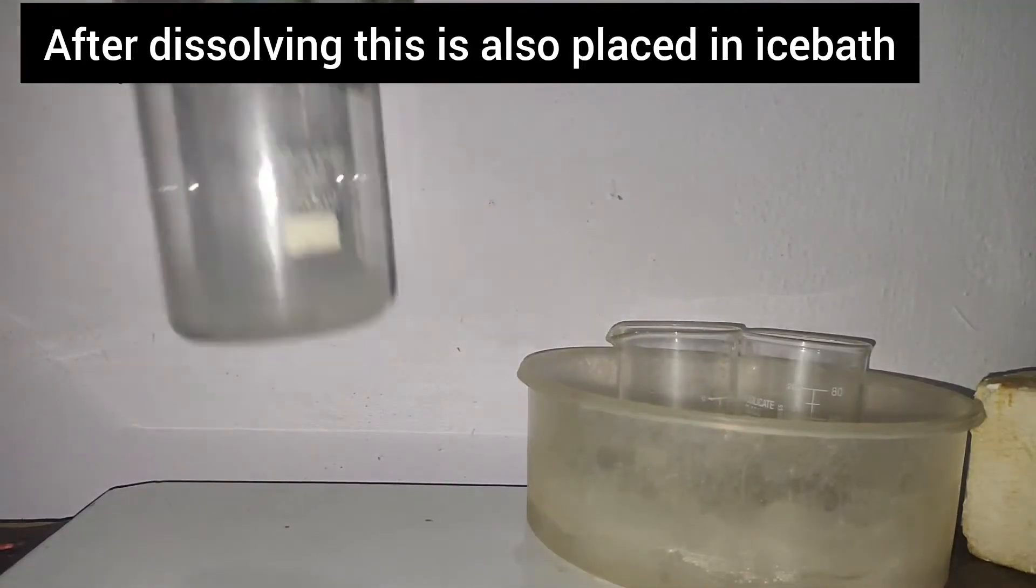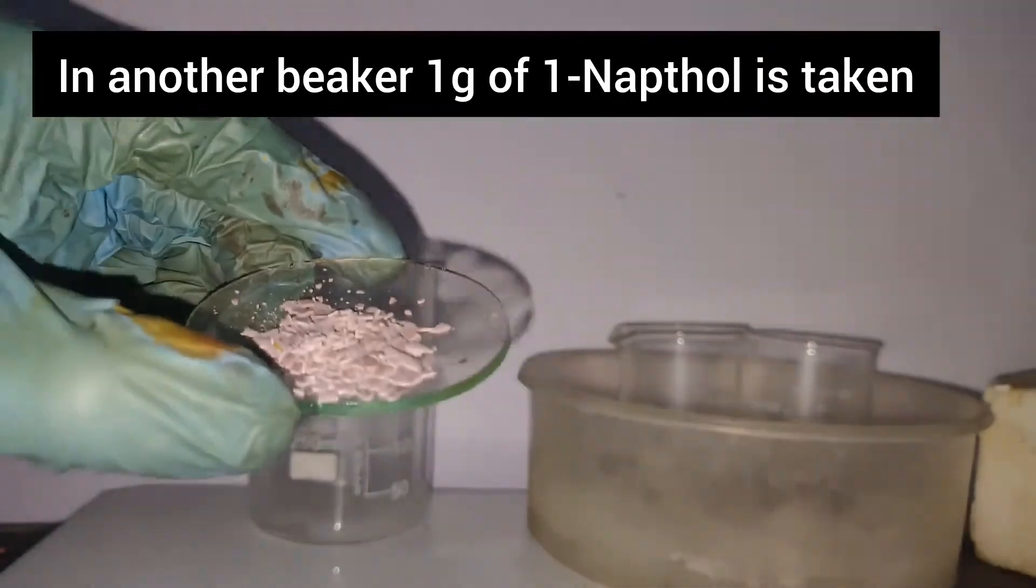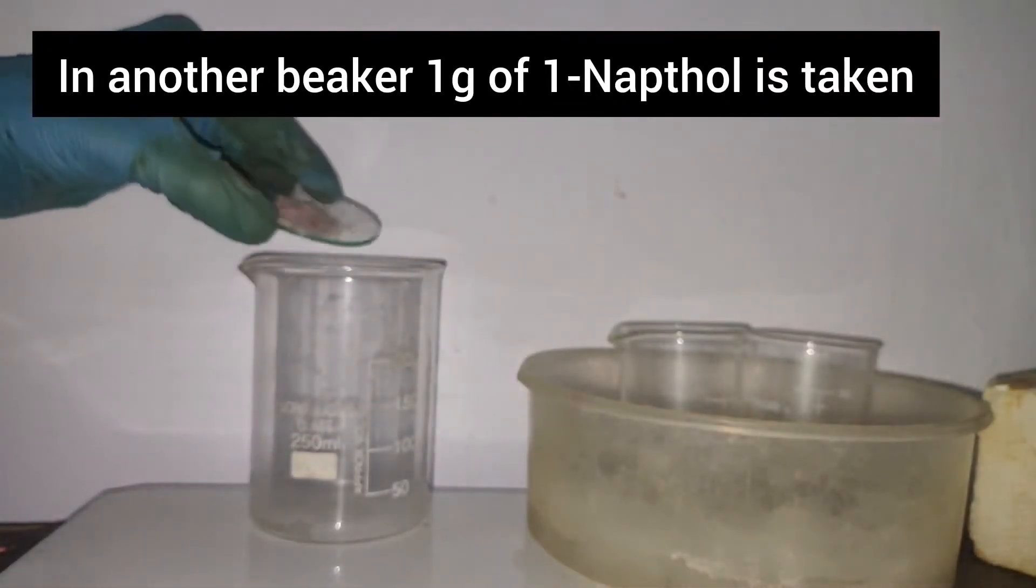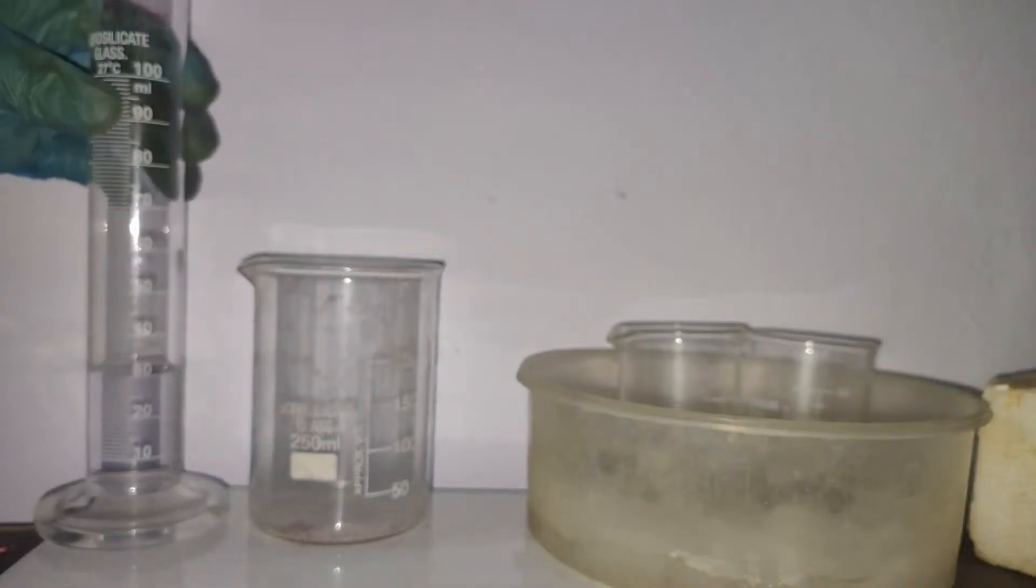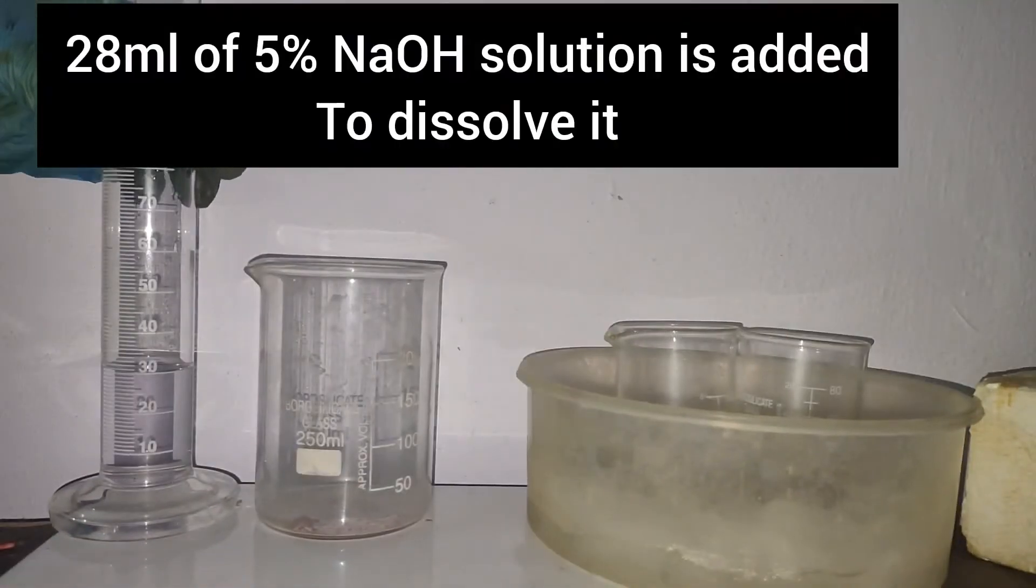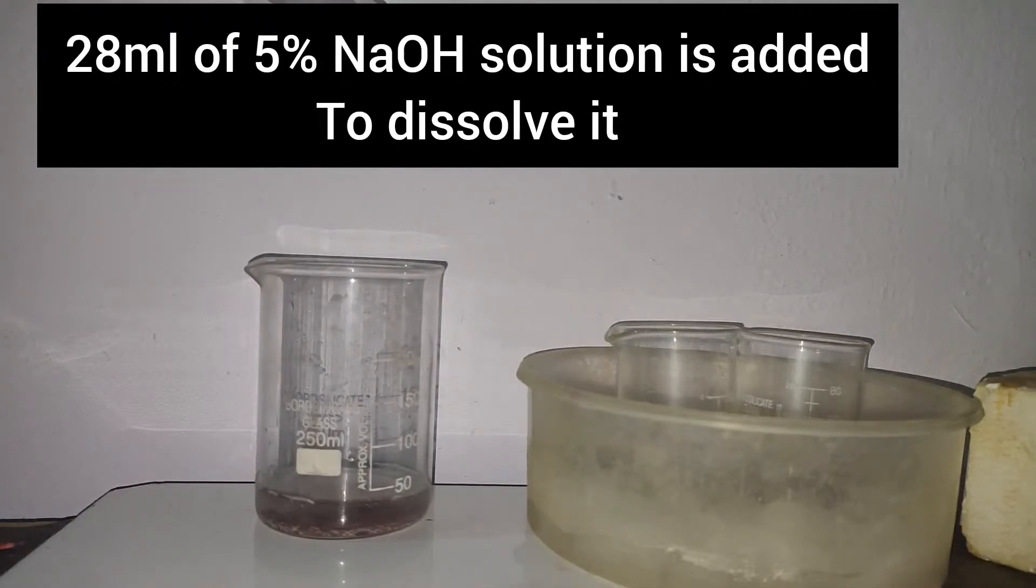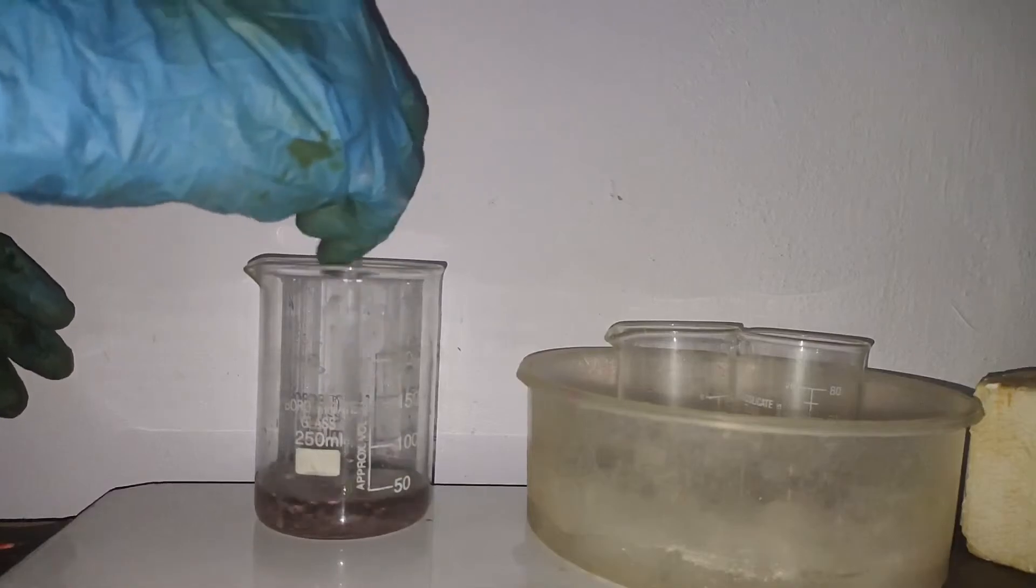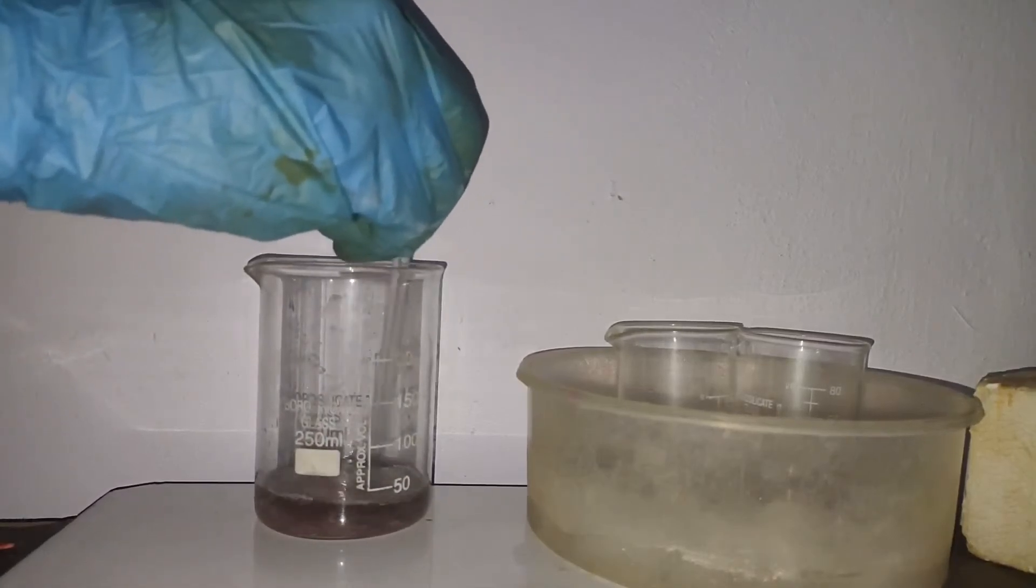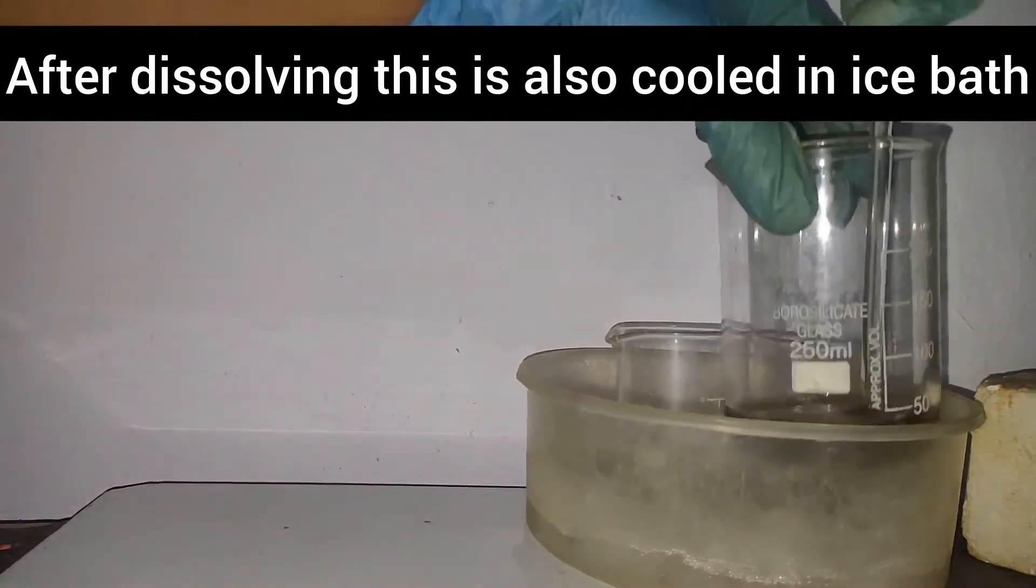Then a 250 ml beaker was taken. Inside that, 1 gram of 1-naphthol was added. To dissolve this, 28 ml of 5% NaOH solution was added and stirred to dissolve the 1-naphthol. After dissolving, this was also cooled in an ice bath.